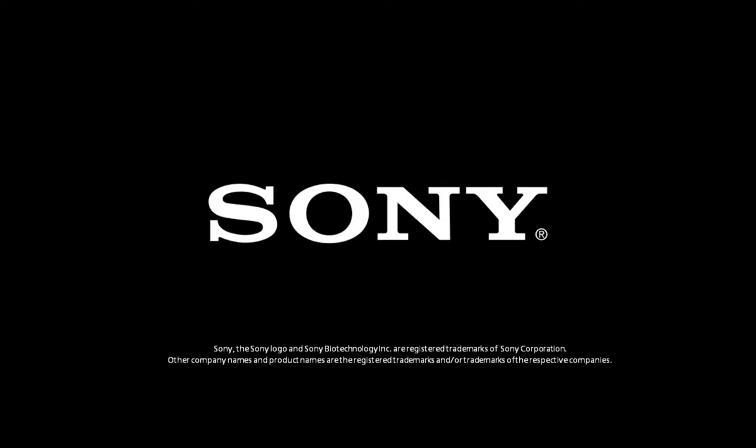I can take that question. So the Sony sorting chip can be scanned and used for the whole day for 24 hours. It does not get saturated, regardless of how many samples you run. If there is any air or cells that get trapped or clogged in the chip over the course of the day, those can be resolved simply by priming the chip or doing a back flush as we showed in our presentation.